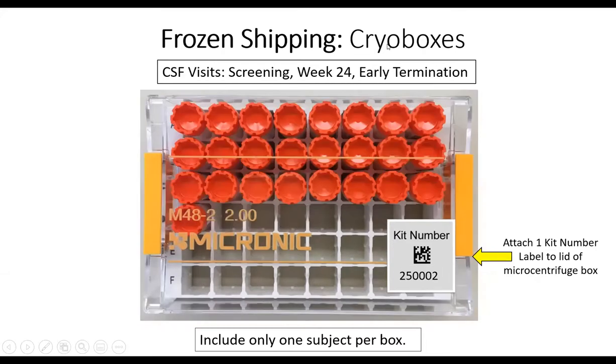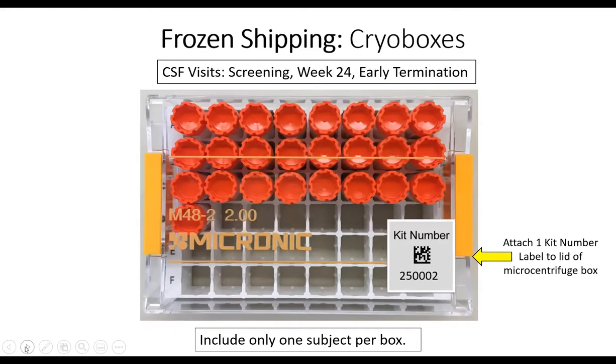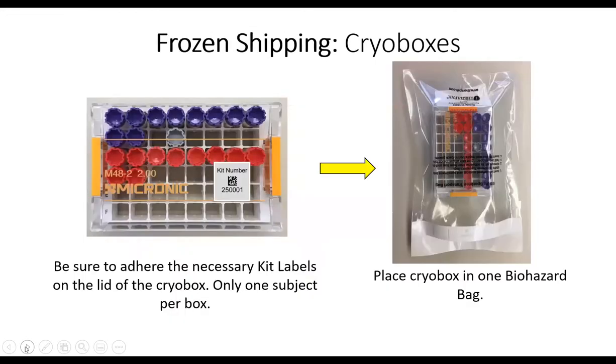Here's what the CSF collections will look like in their box. So note that these are only the orange cap cryo vials. The 2 ml Sarstedt tube does not fit into these boxes, so we'll go over how to package that one up next. But again, please only put 1 subject per box and put the CSF kit number label on the outside of this box as well. And note that this kit number is going to be different than this kit number.